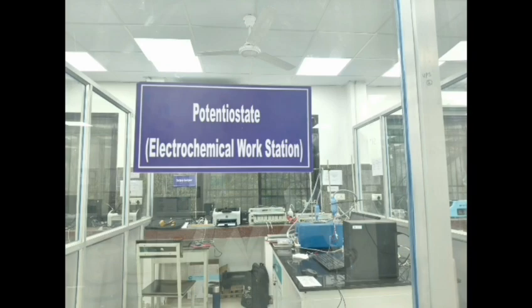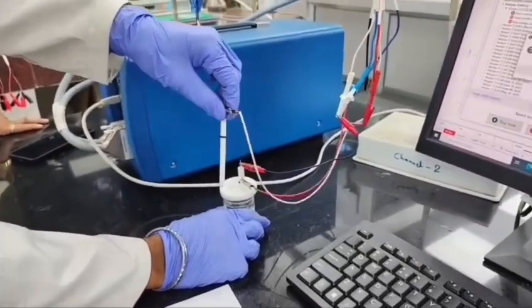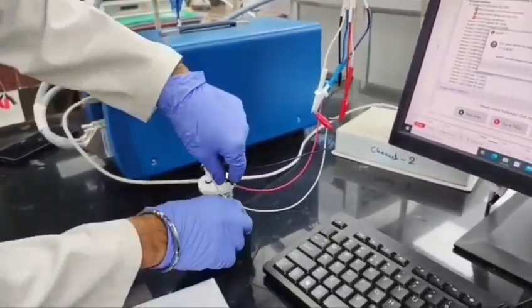Now let us move to take the reading from cyclic voltammetry. There are three electrodes: first is the reference electrode, second is the working electrode, and third is the counter electrode.